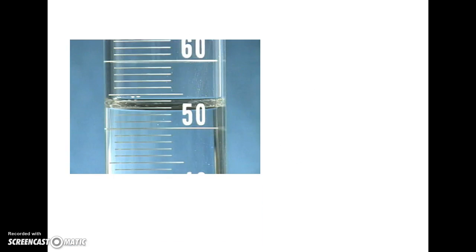Let's try this. Take two major graduations, 60 and 50, for instance. 60 minus 50 is 10. And there are how many spaces? 1, 2, 3, 4, 5, 6, 7, 8, 9, 10. So 10 divided by 10 is 1. So each space is worth 1.